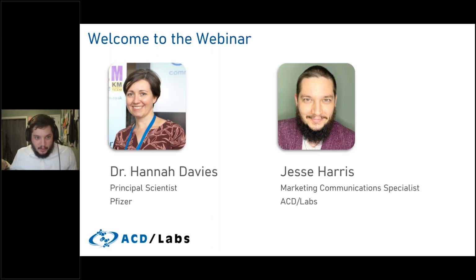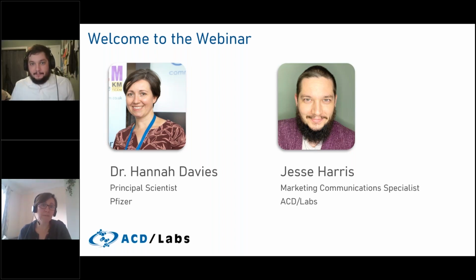Going through more of these questions. Will you be able to do trend analysis using stability data? Yeah, I guess you can look for trends. Is the question related to particular software that might be available? I'm not sure. I don't have a whole lot of context with this one. Yeah, I mean you can visually look for trends. Like we touched on earlier, there is that ability to build graphs as well and look at trends in that way.